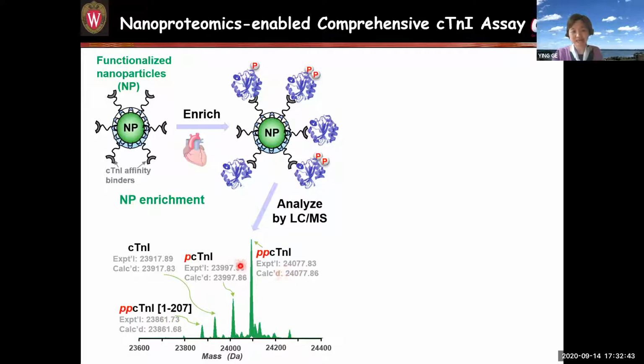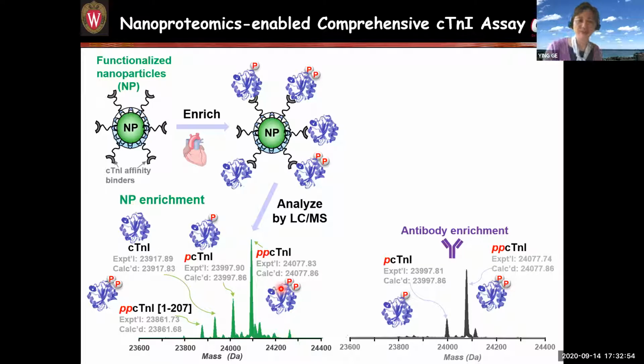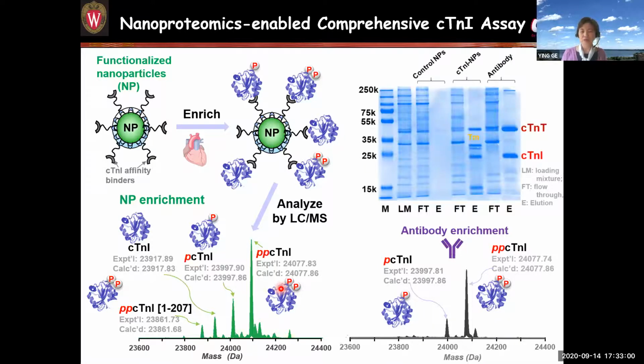You can see the high accuracy we obtained based on these data. In comparison to antibody, our nanoparticle is able to enrich more diverse proteoforms than the antibody enrichment.